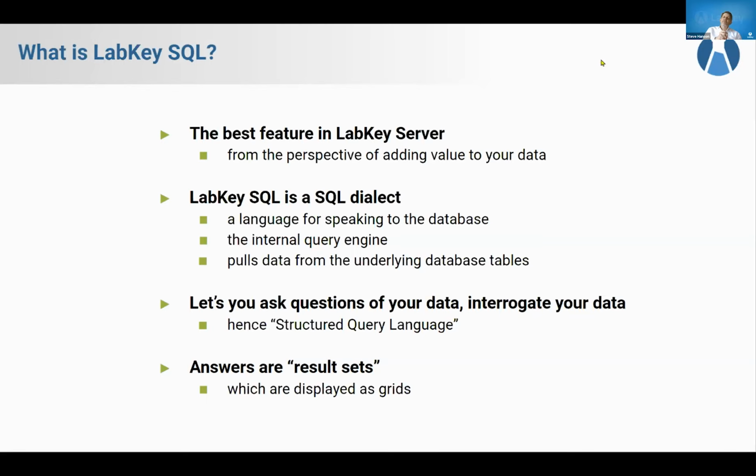SQL stands for Structured Query Language, and you should really take query seriously there. It lets you ask questions of your data. It's really about interrogating your data. Whenever I have to write some SQL, I often begin with an English question. It helps first clarify what you're trying to do. So you can often start out by saying, what I really want to know is which cohort performed the best on this metric, body weight, or on this metric, immune score.